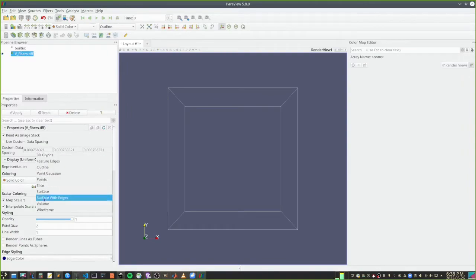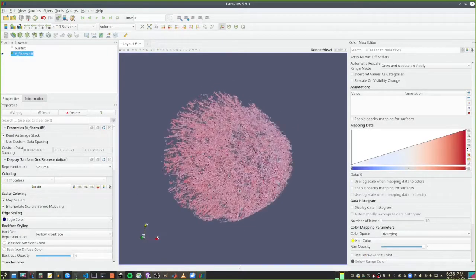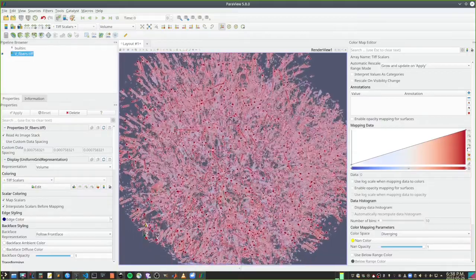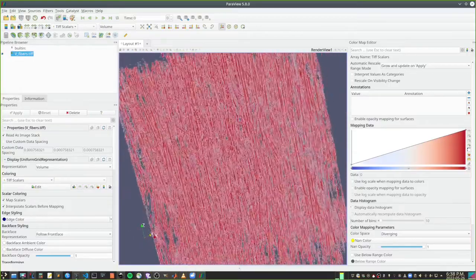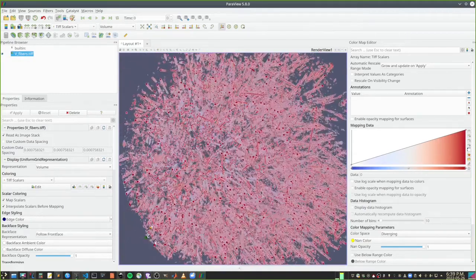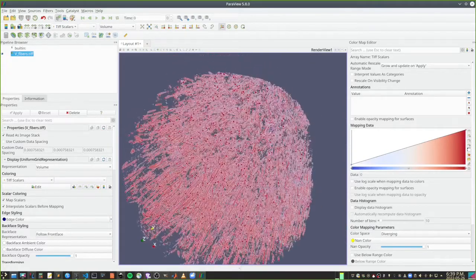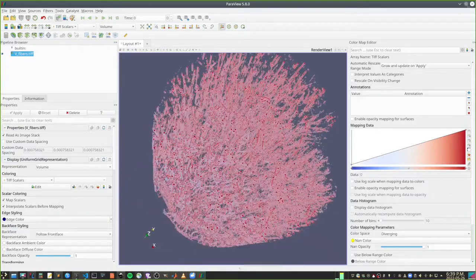See if it looks normal, if there's not something weird. For this kind of filling fraction, it's nice because we can actually see something. For some of the higher values, it's just a jumble like this. At least here across the extrusion direction, it's fairly clean. But it looks okay. There's nothing really like it's not confusing a pore for a fiber or something like that. So this is good.